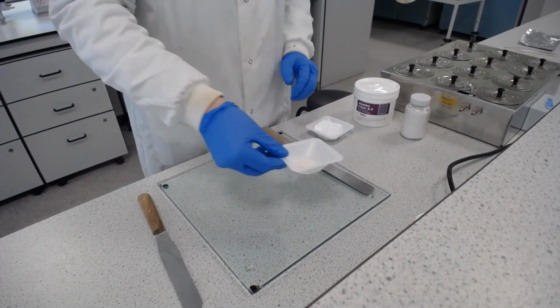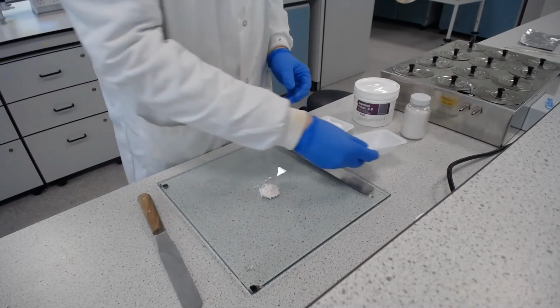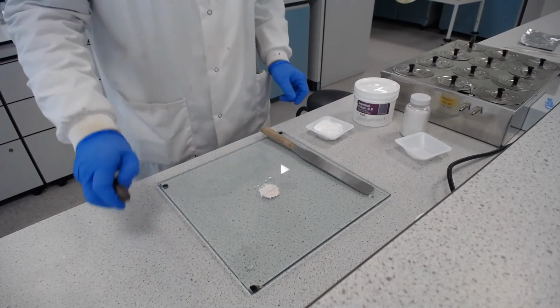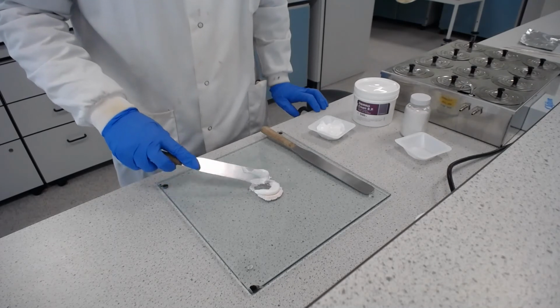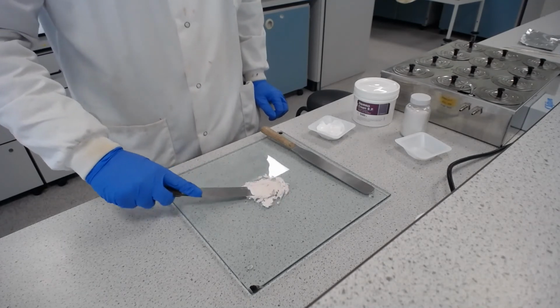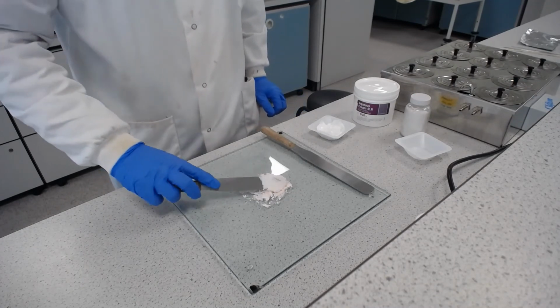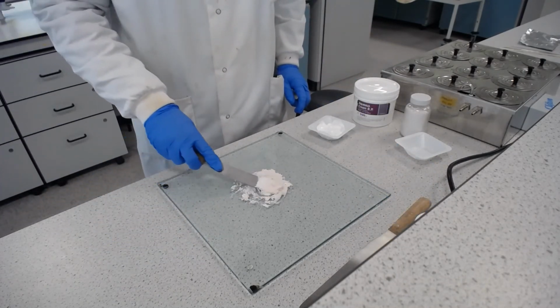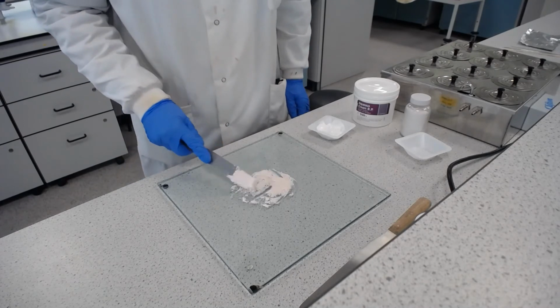So to do this, we take all of our dry insoluble powder and put that into the middle of a clean slab. And then we take a small amount of the base that we're going to use and then slowly start to mix them in with each other. Now this powder might be quite light and easily blow away until we get it into that wet mixture. So until we've got that initial paste, we need to be quite slow and careful about how we incorporate the powder into the small amount of base that we've got on the slab.